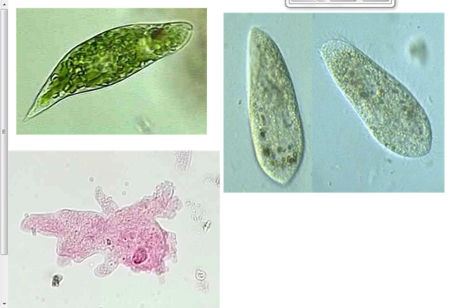All right, up here, this is a euglena in the top left. It's obviously much smaller than this when you look at it. In fact, on the scanning power, when you first put that slide in, if you have it properly focused, they will look like small blue slivers. That's how small they are, small blue slivers when you get that under scanning power. You may even have to use the high power or the low power lens, kind of like a scanning lens, and get one on the end of the pointer. They're that small, right? But definitely draw it on high power once you get it focused.